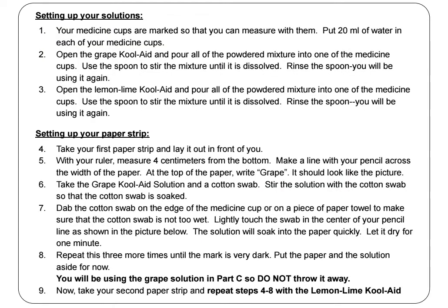Pause the video now to follow our procedure for setting up your solutions and paper strips for this chromatography experiment.